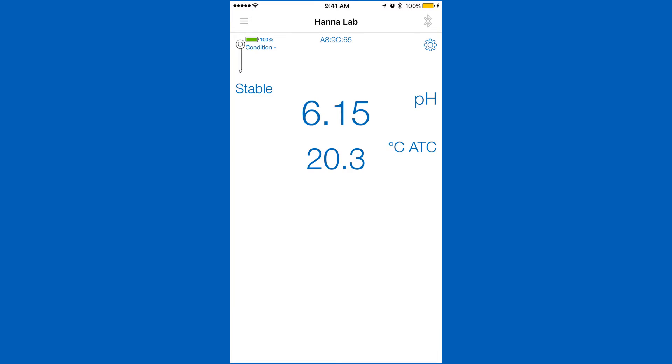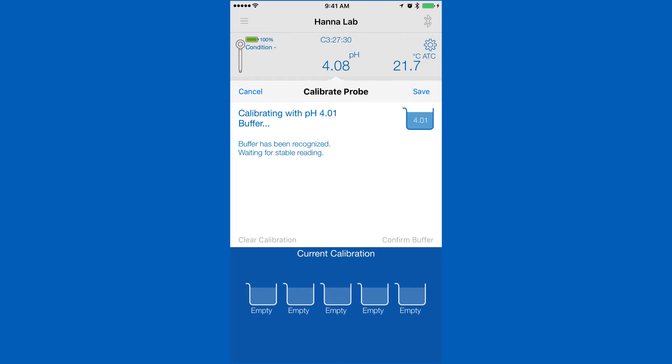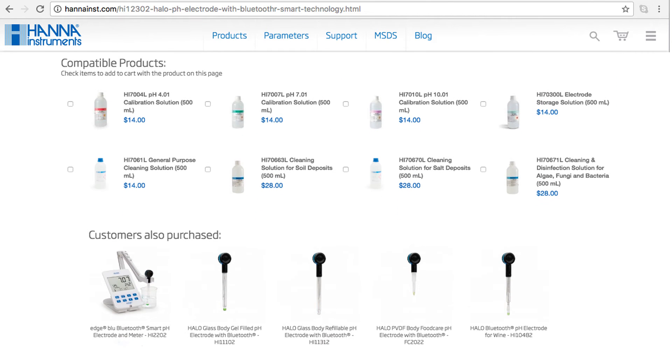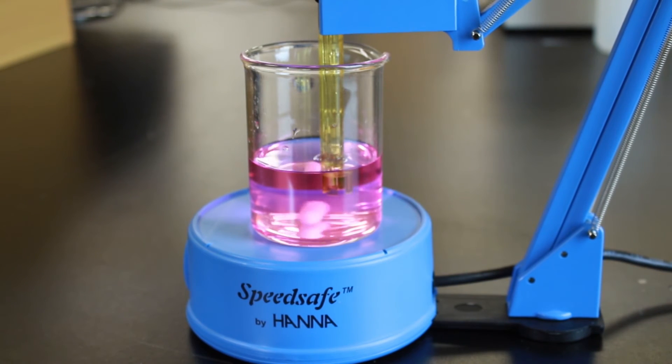Calibration is an important part of keeping your Halo operating at its best. We recommend calibrating before each use. To calibrate your Halo pH meter, go into the settings menu. Tap calibrate and you will be taken to the calibration screen. Your Halo can calibrate up to five points that are automatically recognized. You can find all the calibration solutions you need right on the product page.